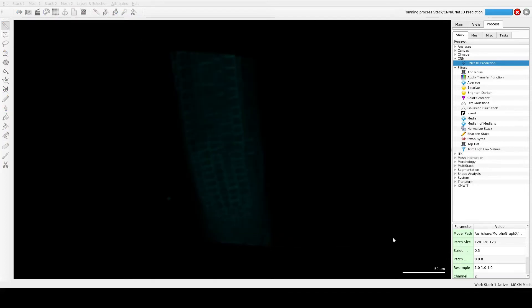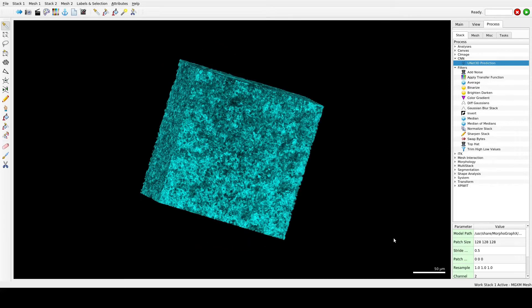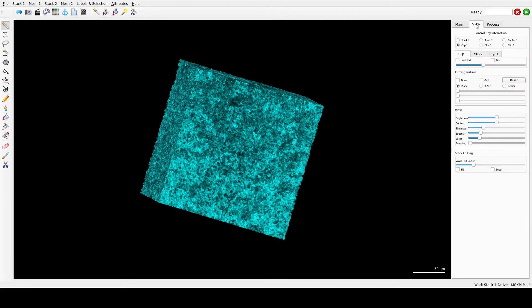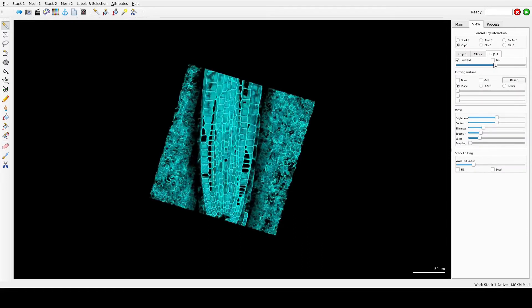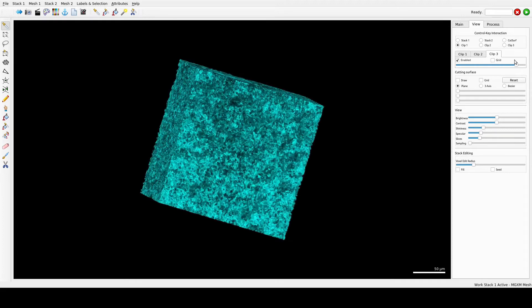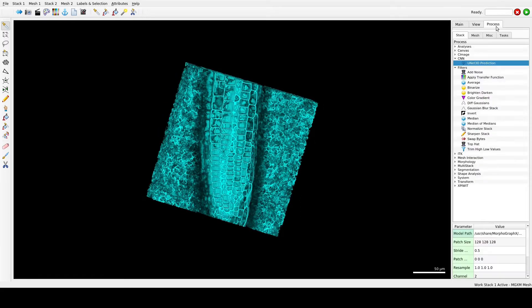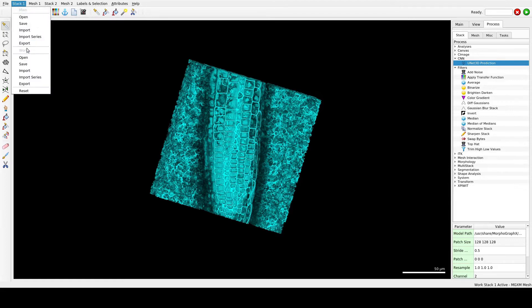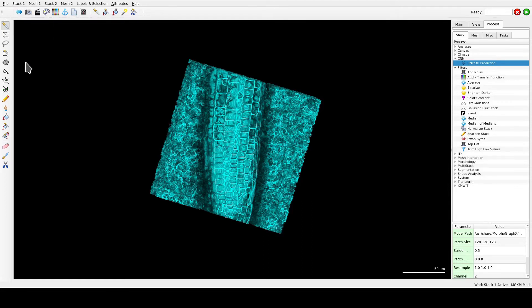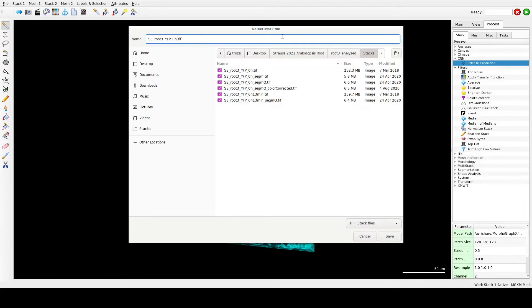This process will take quite some time to run. Now the process is done — we can look at the results by clipping the planes. You can see the cells are quite clear. Remember to save this stack: Stack > Work > Save, and call it CNN.